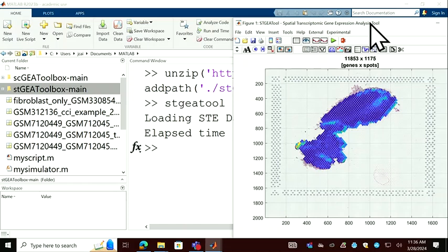But the major ones, yeah, that's good. It just takes some time to load. It's fine. So the raw data for this sequencing will be the cell count matrix plus the location, right? Yeah, that's right.